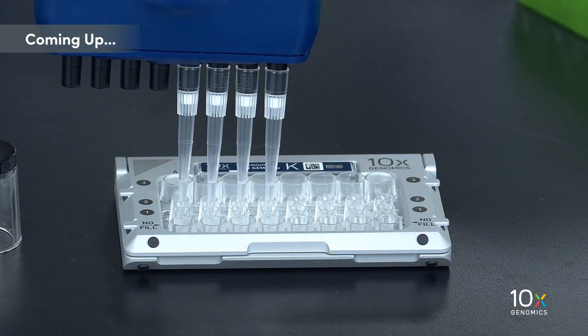We have combined our master mix, water, and cells. Now we are ready to load the Chromium NextGem chip.